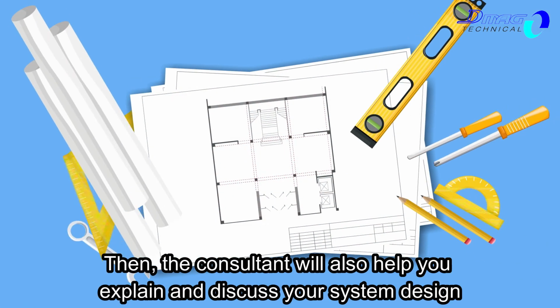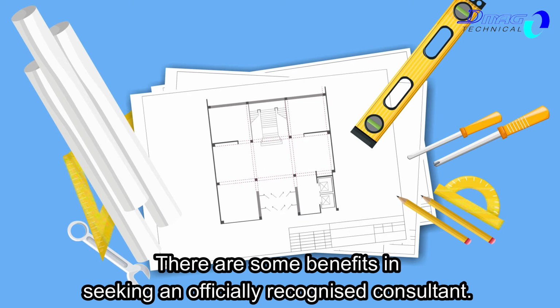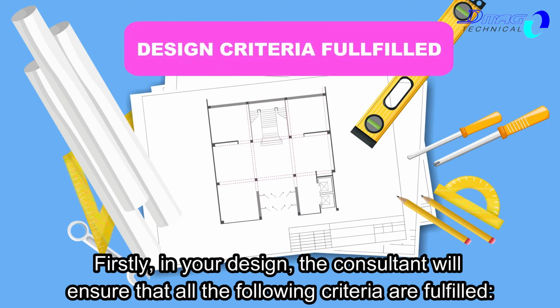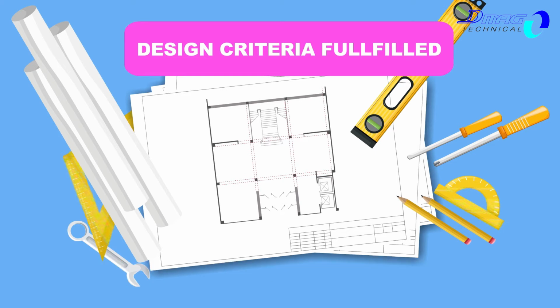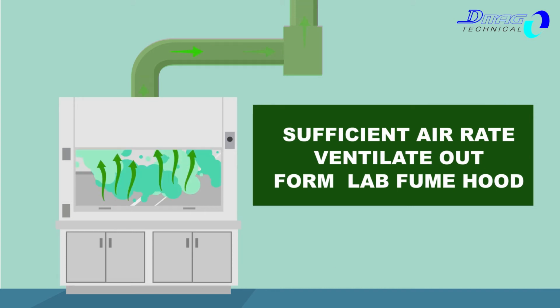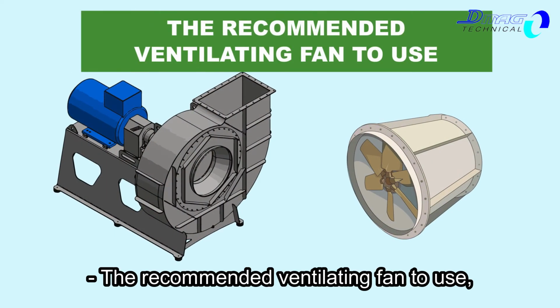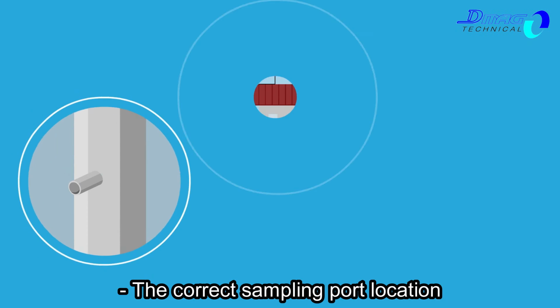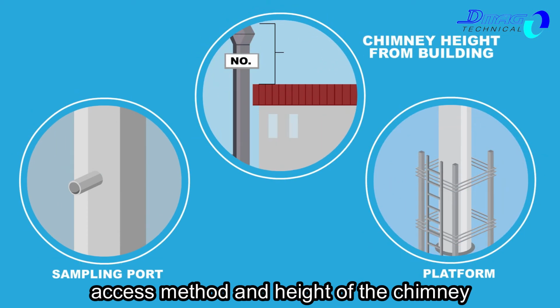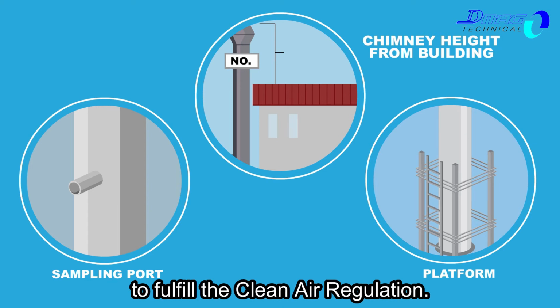Then, the consultant will also help you explain and discuss your system design with the DOE throughout the written notification process. There are some benefits in seeking an officially recognized consultant. Firstly, in your design, the consultant will ensure that all the following criteria are fulfilled: the accepted rate of air ventilated out of the fume hood, the accepted air velocity within the air ducts, the recommended ventilating fan to use, the correct sampling port location, access method, and height of the chimney, as well as many other criteria to fulfill the Clean Air Regulation.